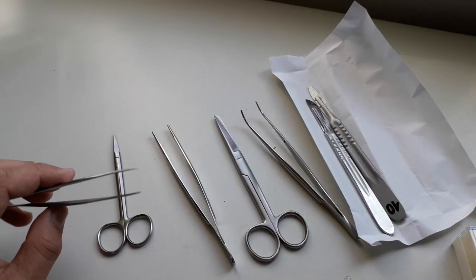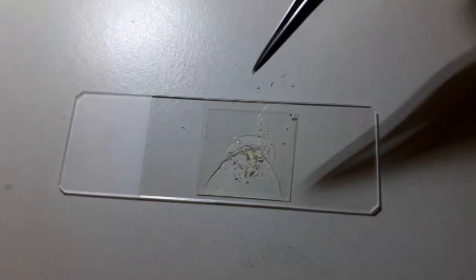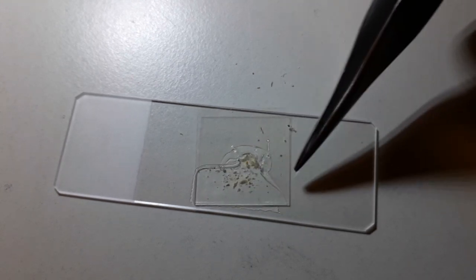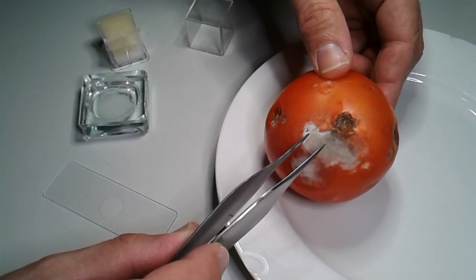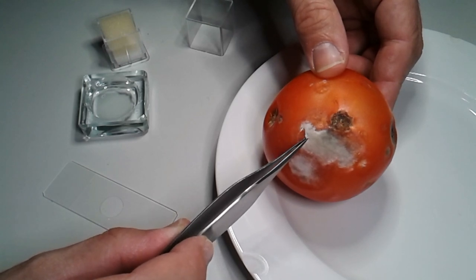So this also kind of replaces those pipettes here. And it also allows me to position the cover glass on the microscope slide and do all of these things. So I would say if there's any microscopy accessory that you want to buy, this one has a high priority.